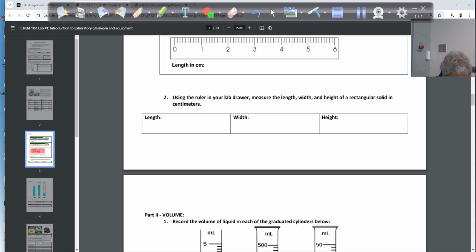What's that? In the back of it, what does it say? Where is it? No, not this. We are using this one, up front, not in the back. We have two scales. The inches are in the top, correct? I think the inches are in the top, larger, and the smaller is the centimeters.